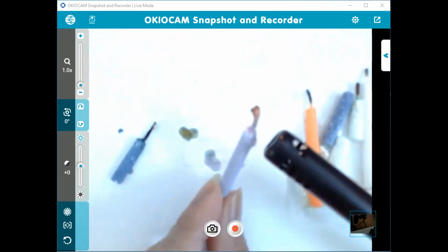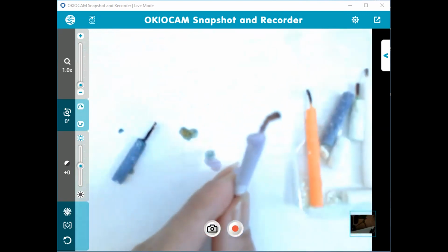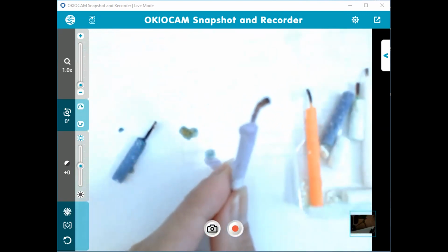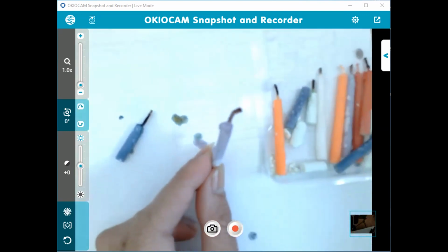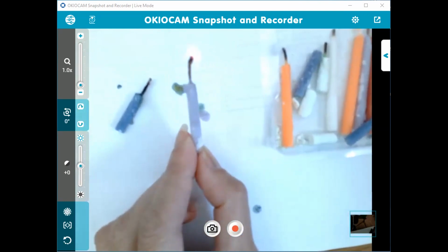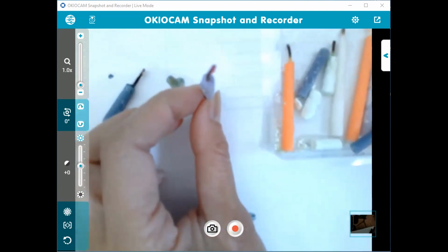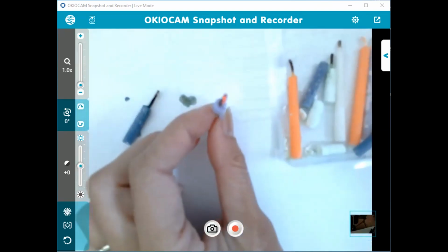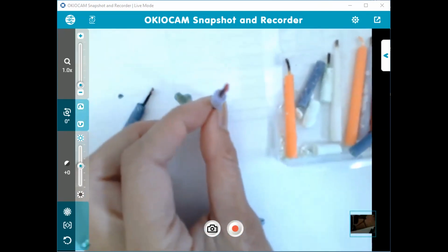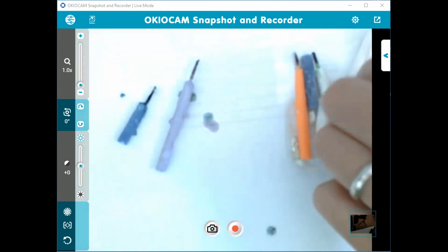But you will see that with experiments, you got to try them out before you figure out if they work or don't work. So this one's the purple flame, and it is also way too low to see. It's giving off an orange glow right now, but it is actually very, very lightly purple. Not too exciting, huh?